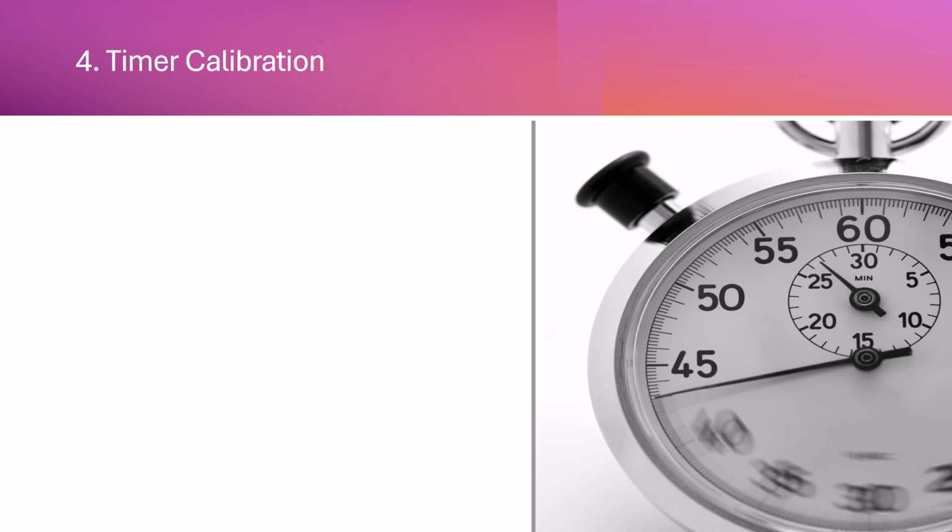So now next one is the timer calibration. The purpose of the timer calibration is to verify the accuracy of the disintegration tester's built-in timer, ensuring precise control over the test duration, which is critical for valid results, right? So let's start with the procedure.